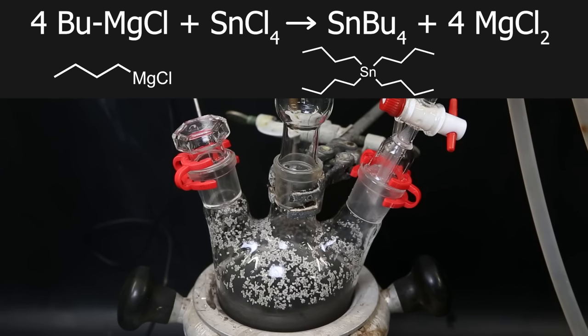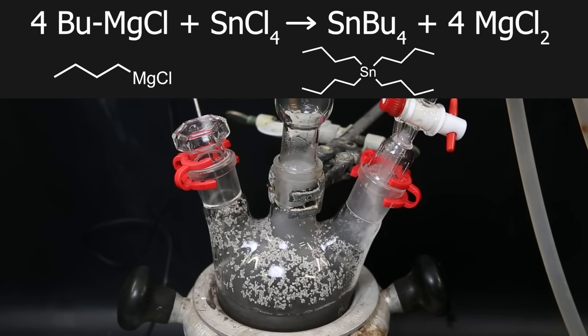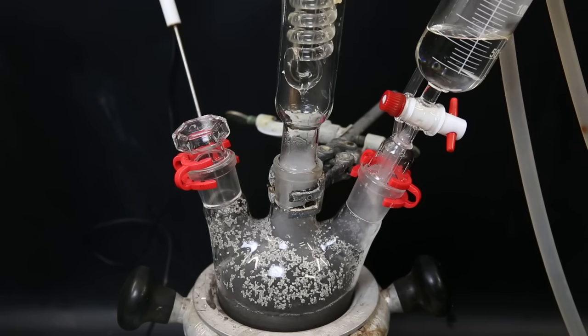In this reaction, the Grignard reagent reacts with the tin 4-chloride in a simpler way than regular Grignard reactions. Here the butyl groups can attach themselves to the tin and kick off the magnesium chloride and form tetrabutyl tin instantly, without the need for hydrolysis of the product.